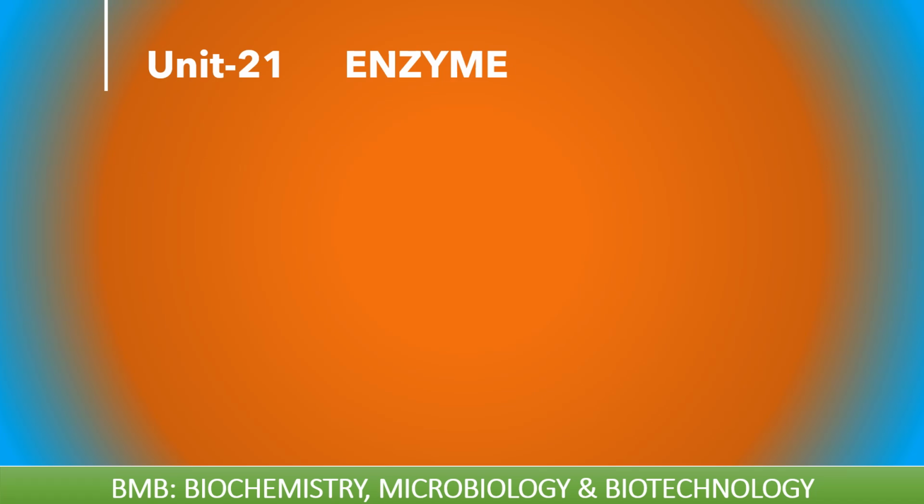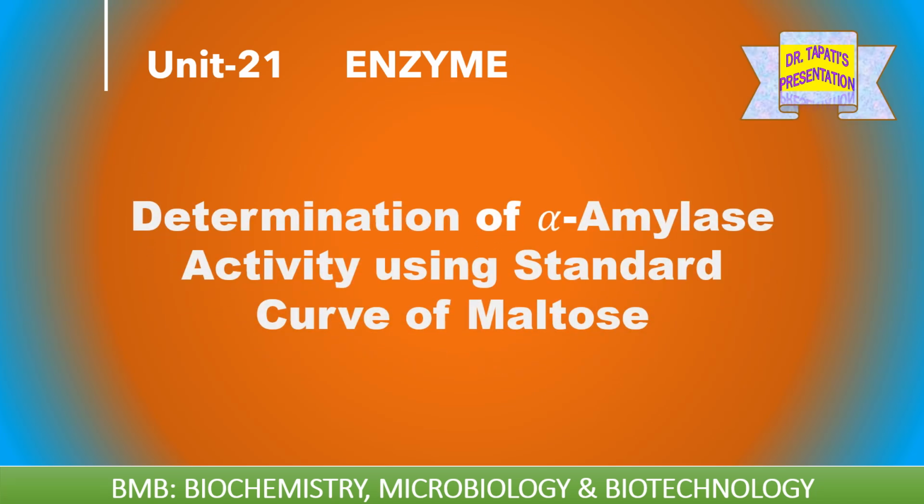Today in this video, the topic of discussion is determination of α-Amylase activity using the Standard Curve of Maltose.